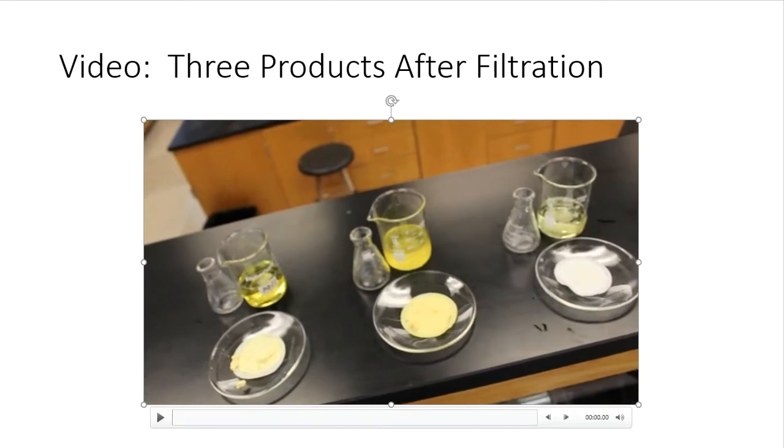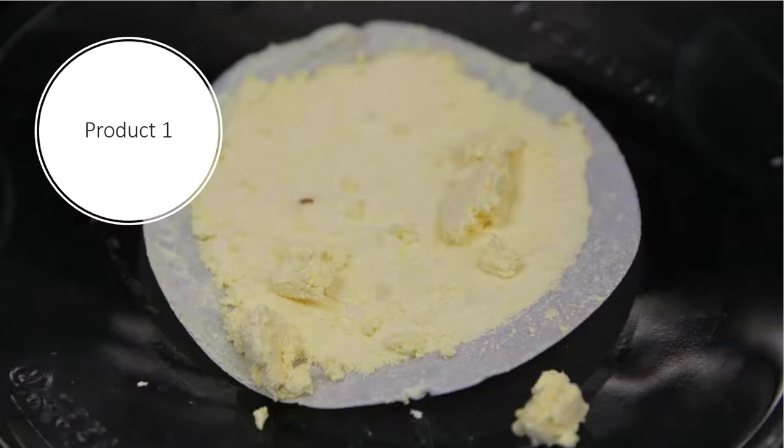All right, folks, so notice at no point in time did I take a measurement of a filter paper. And the reason that I did this is because the mass of the filter paper was not important. I knew that this was not going to be the last step. I knew that we had a recrystallization that we had to do. So with this one, it was almost silly for me to go through and get masses of filter papers, because never did the lab tell me to report a crude percent recovery. It just wants percent recovery at the end of this process, after the recrystallization has been performed.